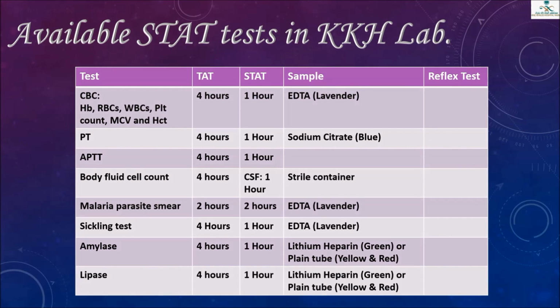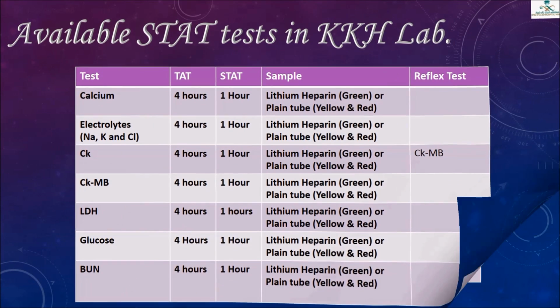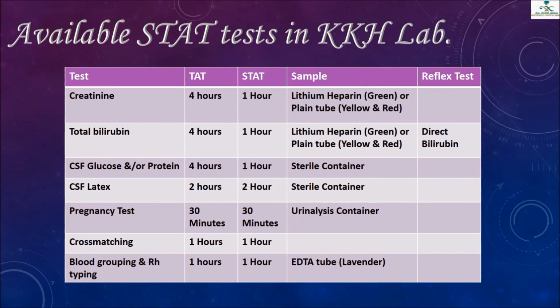This is a list of stat tests in KKH lab according to the policy. Please read the policy regarding stat tests.